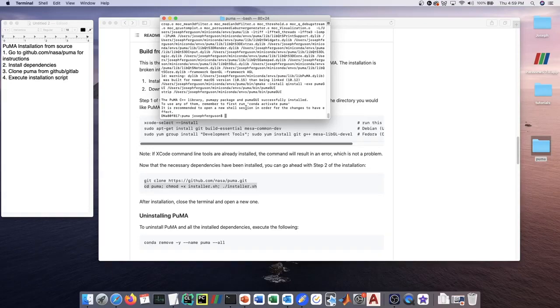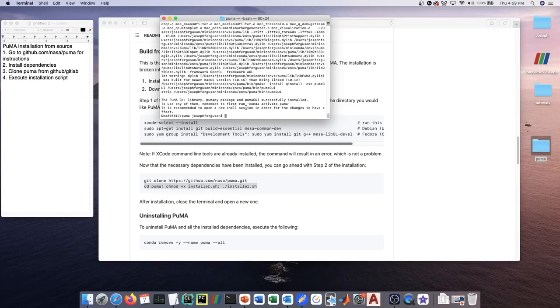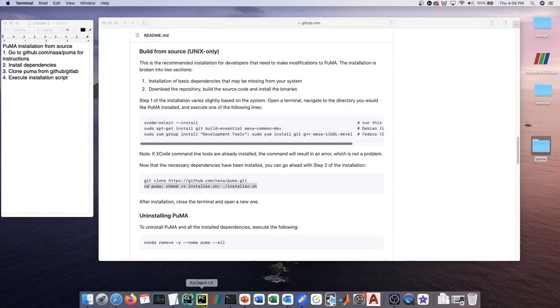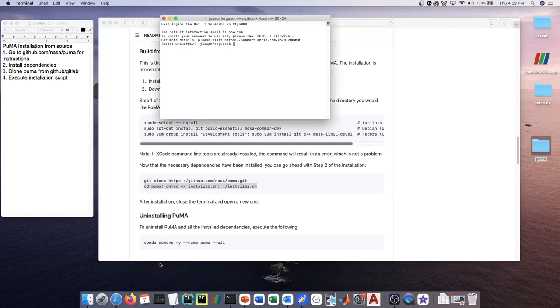Okay, at this point, Puma has been installed successfully. Since the first step was installing conda, if you did not already have it, in order to initialize conda in your terminal, you're going to have to exit out and open a new terminal window. You should see this base appearing on the left.